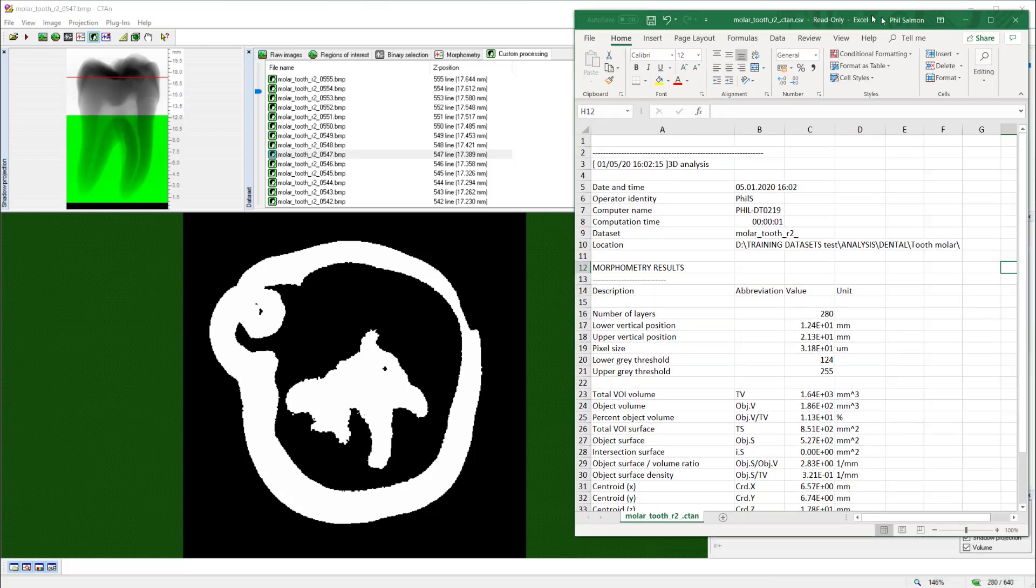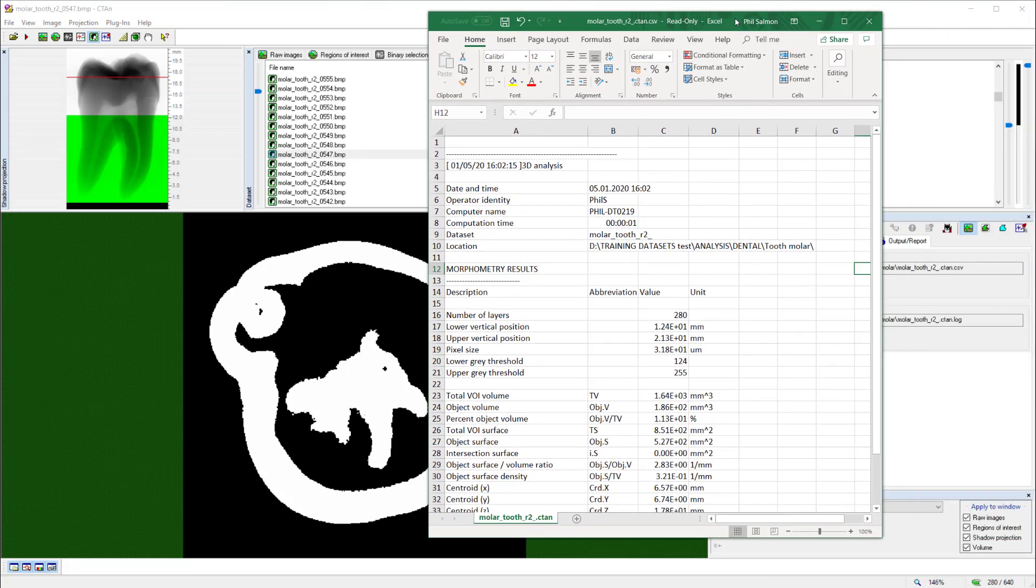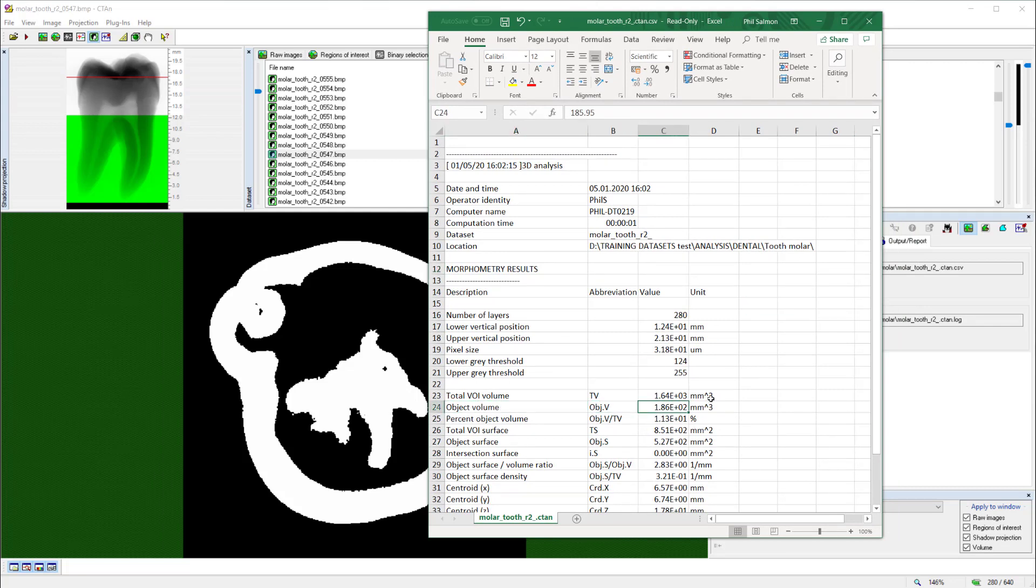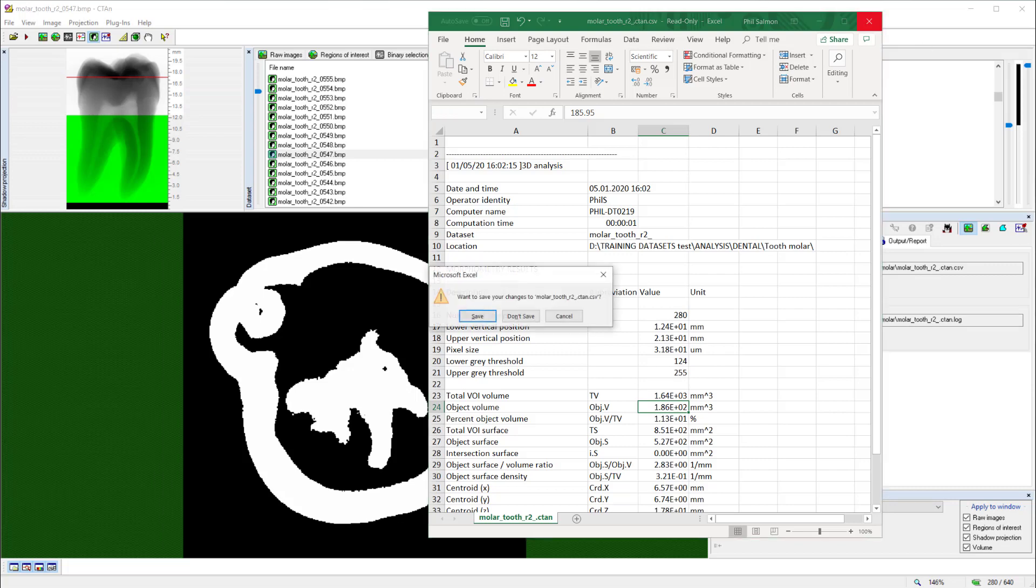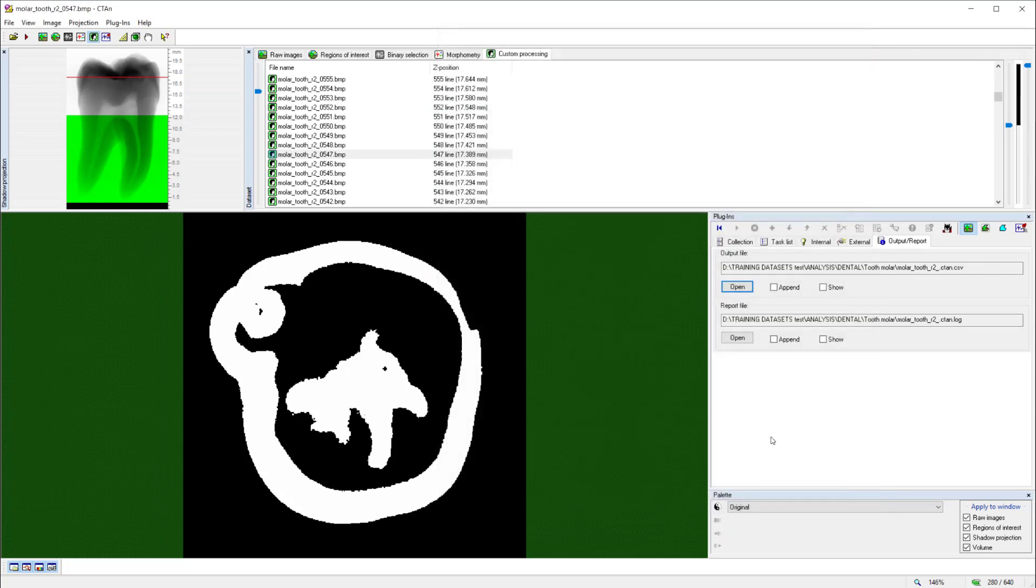If I move that into our window so that we can see that, we can see that the object volume, the volume of all the binarized pixels, is this number right here, which is 185.95 millimeters cubed. So about one-fifth of a milliliter of enamel in our tooth.